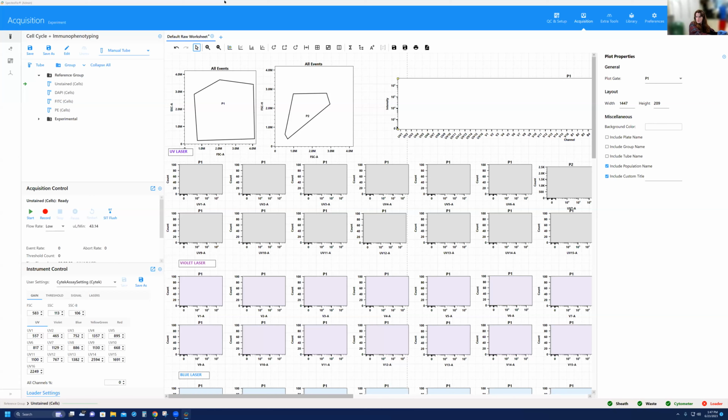Okay. Actually, there is one. We haven't got that far yet, but I'll try and answer it now because I pressed the wrong button when I was doing the Q&A. Marisa is asking, can you use DAPI as a live dead dye in this experiment? Well, the answer to that is no, because the cells are going to be fixed. I mean, you can use DAPI as a live dead dye, but it has to be done on unfixed cells. Exactly, which is why we would have used one of those fixable viability dyes today if we wanted to get rid of the dead cells. Exactly. That's a great point.